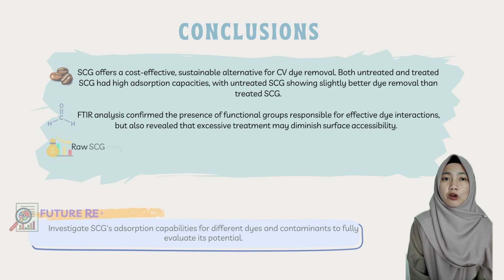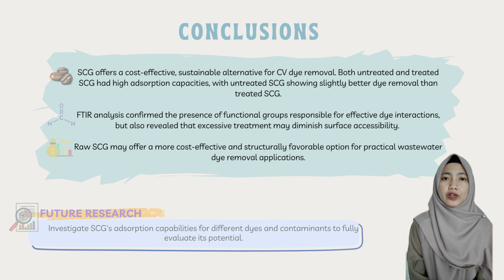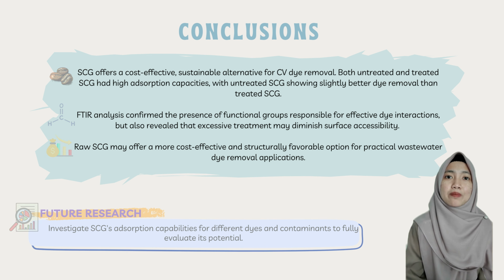To wrap up, both untreated and treated spent coffee grounds work well for crystal violet removal. Untreated spent coffee grounds perform slightly better and are cheaper to prepare. FTIR confirmed multiple functional groups contributing to the adsorption of the crystal violet. This makes spent coffee grounds a sustainable, low-cost option for dye removal from wastewater.